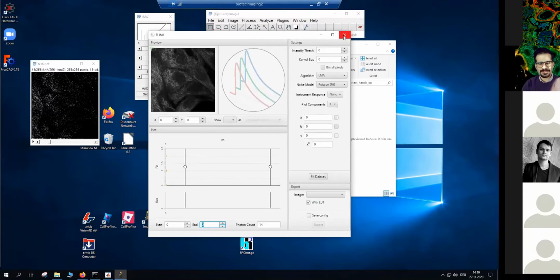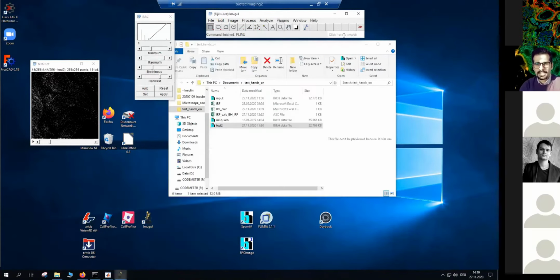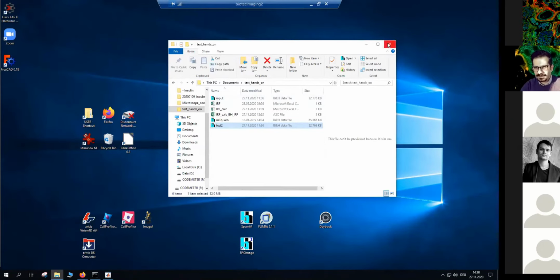Yeah, so I did a test yesterday as well, I actually looked at this data and I was able to see that. Interesting. So this is another point about open source software. They are developing constantly, and there might be bugs still there. So I just go back to the chat and see some of the discussion. What I would usually do in that situation would be to restart the program, because maybe you did something before that messed it up. Exactly, that might work. So I'm just closing that, and yes.